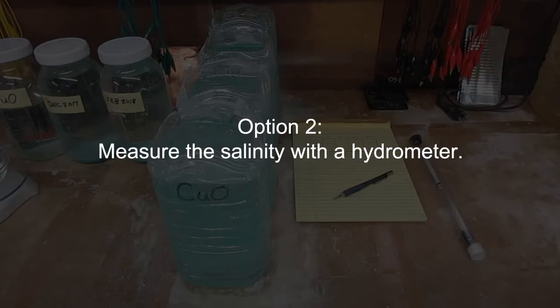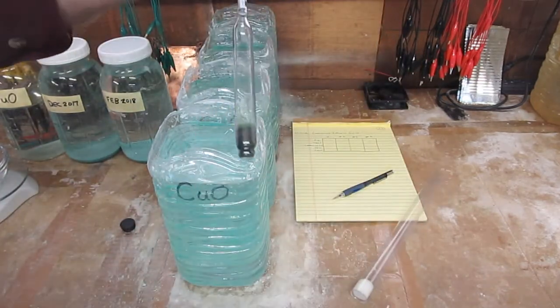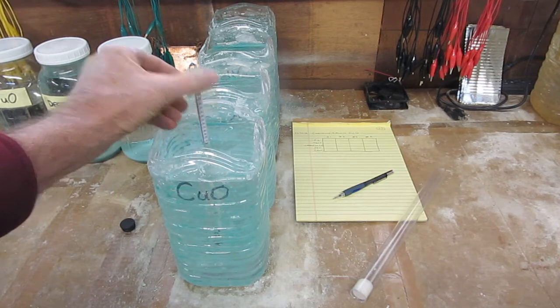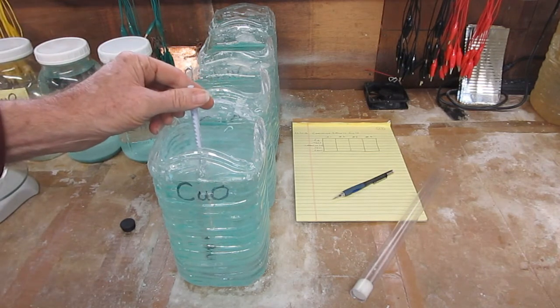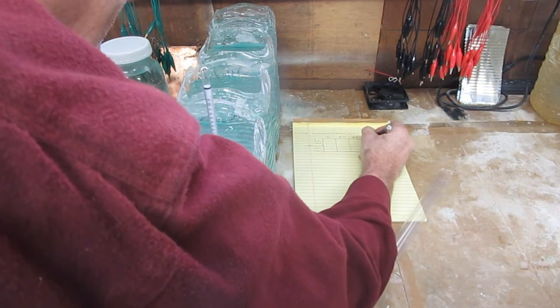Another way to check salinity is with a hydrometer. It's not as straightforward as the optical refractometer. It measures specific gravity, which has to be converted to salinity, but it is a less expensive option. Gently lower the hydrometer into the water so you can read the specific gravity scale. When the hydrometer settles down, read the specific gravity at the point where the water level meets the scale. Make a note of the reading for reference.